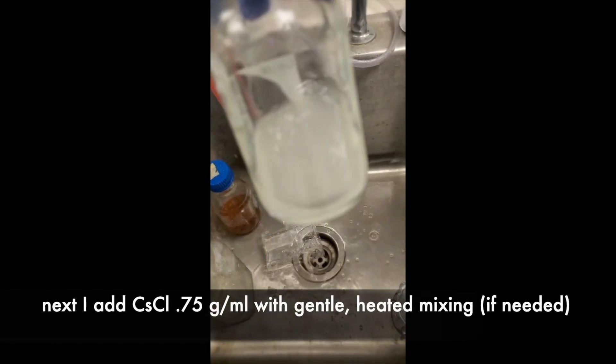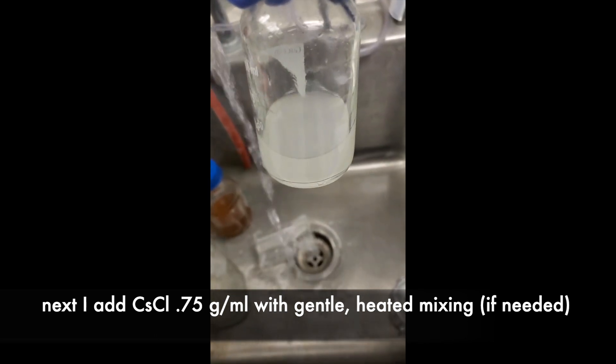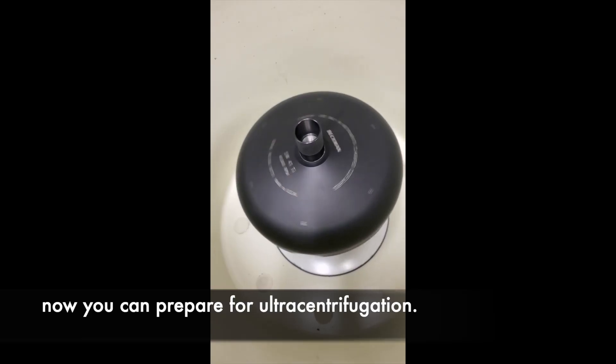Next, I add cesium chloride at 0.75 grams per ml with gentle heated mixing. Your refractometer reading should be at 1.381. Now you can prepare for ultracentrifugation.